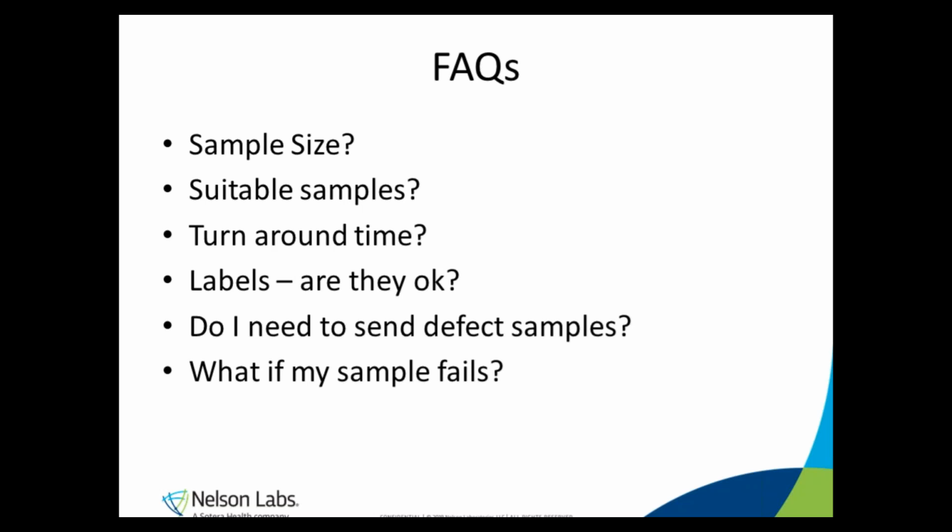If you run into a situation where most or all of your samples are failing, then your sample may not be compatible with the test method. And in that case, we can try altering the method timing steps a little to achieve a suitable test method designed for your samples, using maybe a method with a larger defect size.